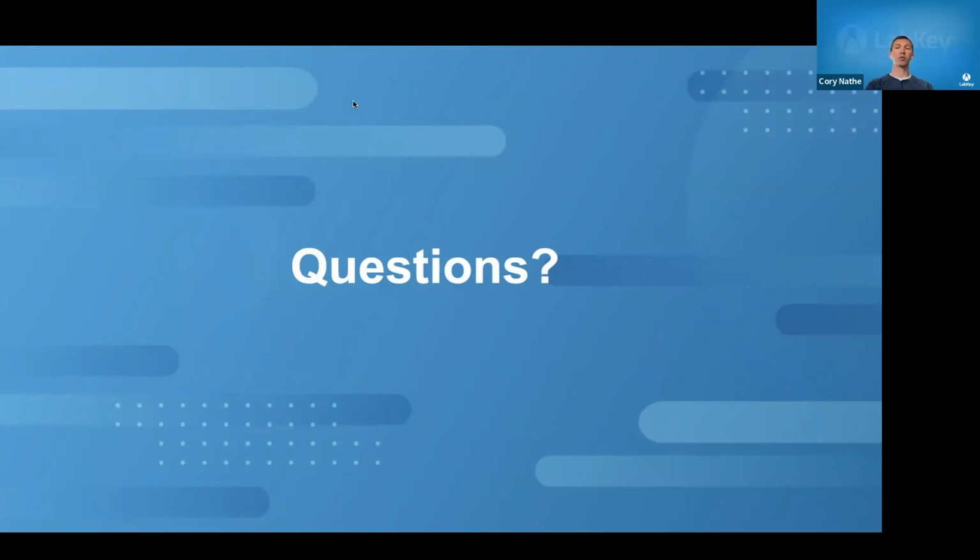You mentioned a follow-up question for field level validation. There are several different ways of doing validation. Within the JavaScript itself, whether it's executing code on field blur or focus, things like that. There are also ways to, and I think it's mentioned in the more advanced topics, do trigger scripts or things like that within the file-based module for different validation. For further input on what exactly you might be asking, please feel free to reach out to us with more specific questions. But your field validation can get quite complex without having to go to a Java-based module.